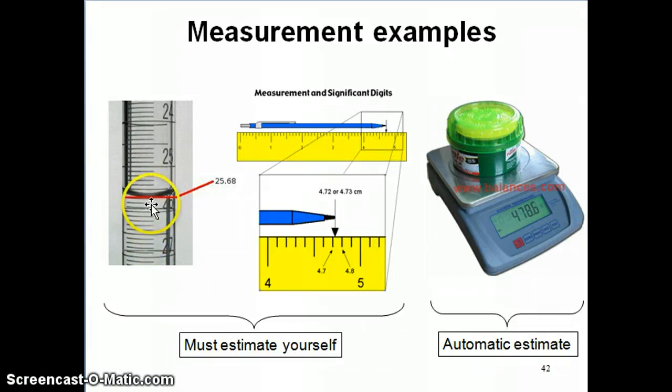So, you want to read it off exactly at this red line, which, remember, is what we call the meniscus of the liquid, which is the lowest point of this meniscus is what you want to read. Not the side, but the lowest point. And if you read the lowest point here, you can see that there's the number 25 right there. That corresponds to that long line. And then there's the number 26, which corresponds to this long line. And then between 25 and 26, we see 10 different marks, the same way as the graduate cylinder earlier.